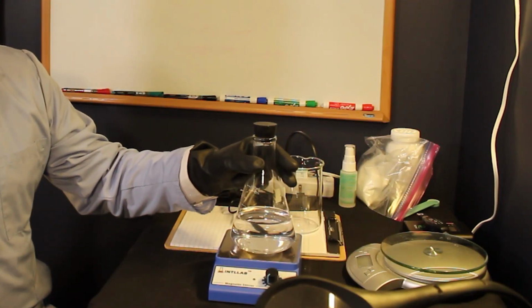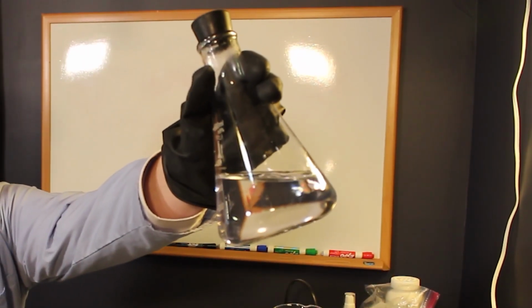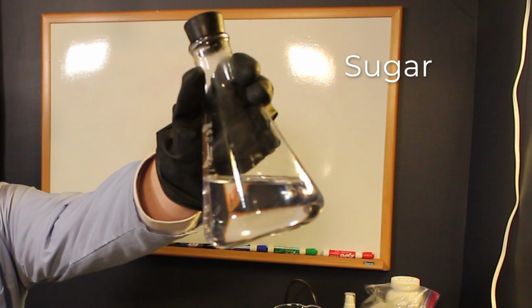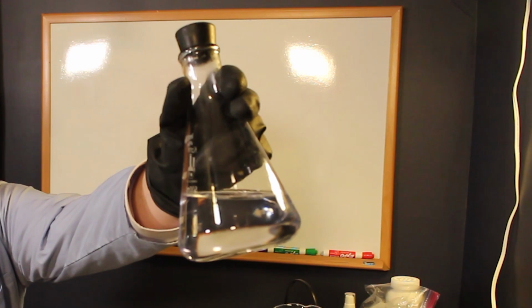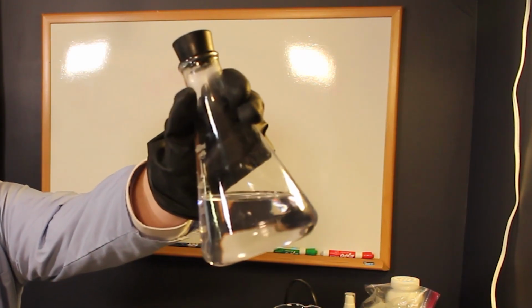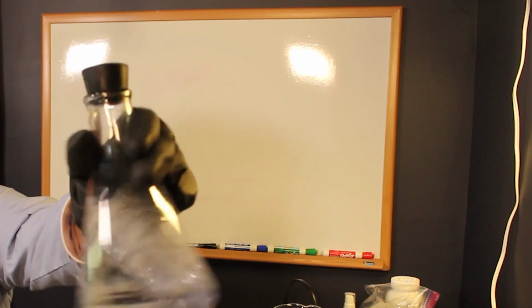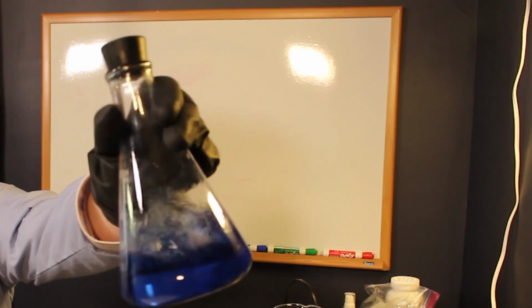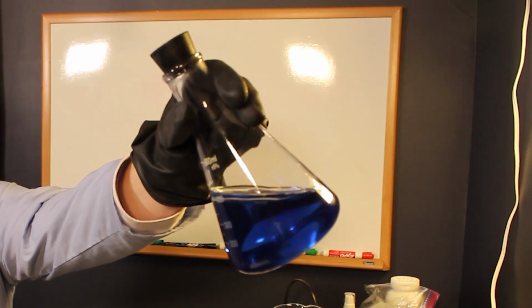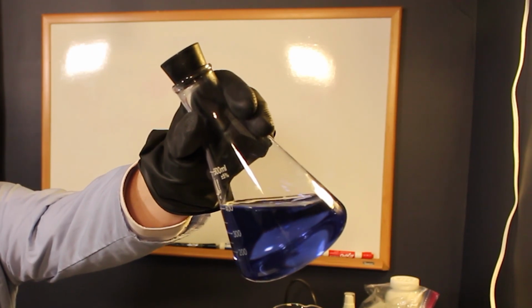So what is happening here in this experiment? In this flask, there are 3 different chemicals: sugar, a basic solution, and methylene blue. Methylene blue is a chemical that has 2 different forms that we can observe. One of them is colorless, and the other is blue. It switches between the colorless and blue depending on the environment it is in. In this case, the methylene blue is reacting to the presence of oxygen gas among the reactants.